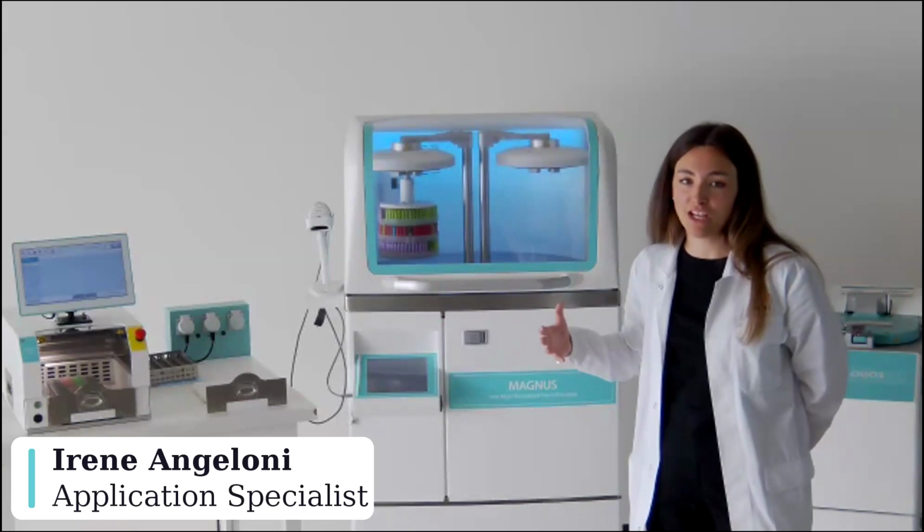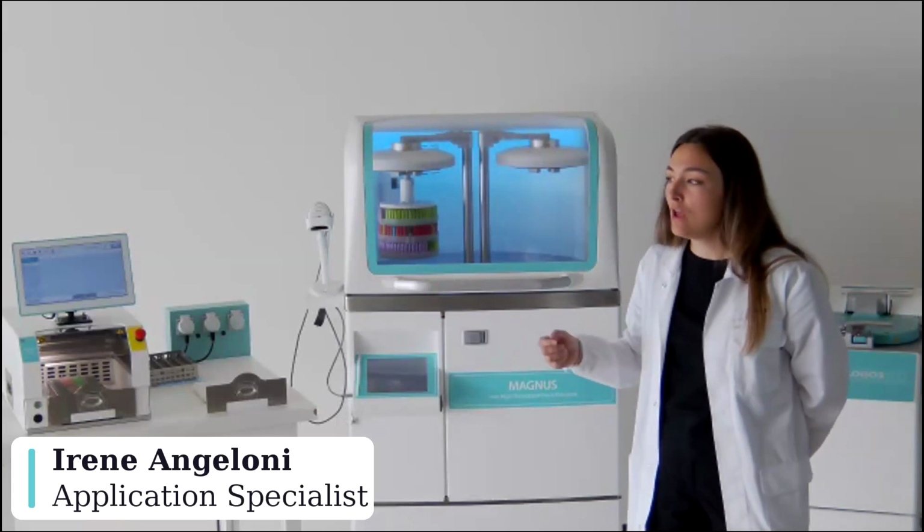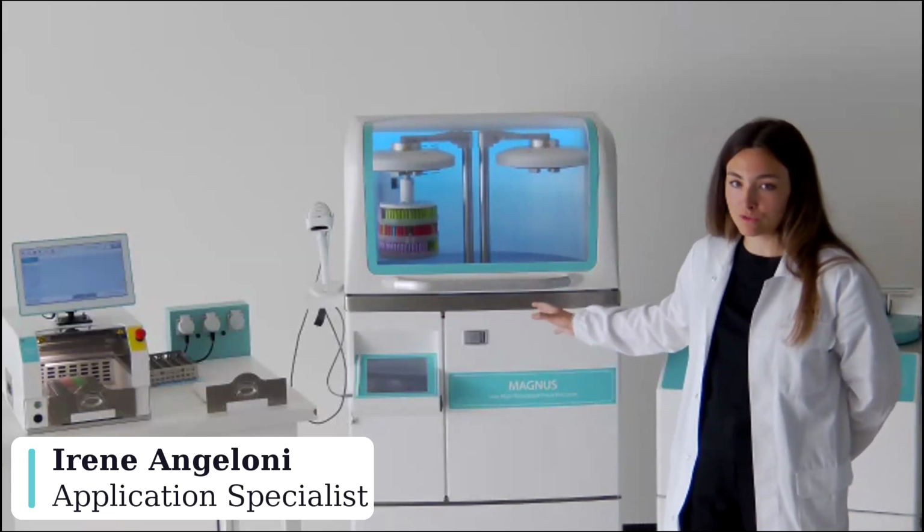Yes, I didn't go into detail on the cavity cleaning, but what is the functioning? In our processor, so in Magnus, but also in the Logos, as you can see, we have two different cavities. One cavity is dedicated to all the reagents such as formalin, ethanol, and so on, while one cavity is dedicated only to wax.